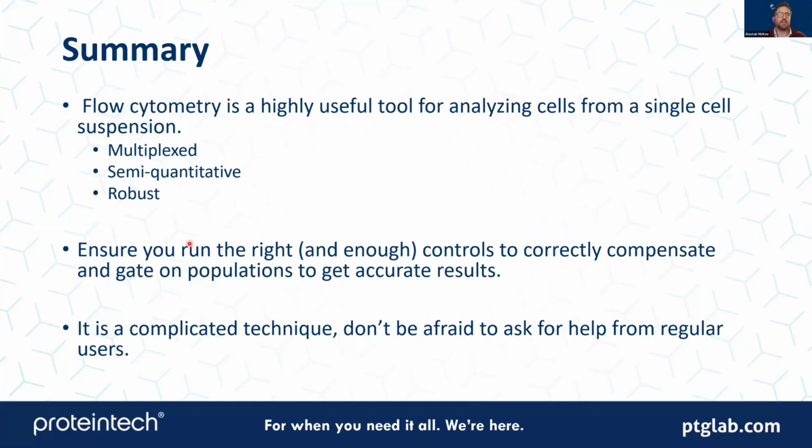And then I think it's important to say that it is a complicated technique, particularly when you're first introduced to it. So importantly, don't be afraid to ask for support from your institutes or places of work that are using flow cytometry already, and just ask them for guidance. Hopefully they'll be able to help you in your first exposure to working with flow, and make sure that you're able to get the most out of your data. And with that, I am all finished.